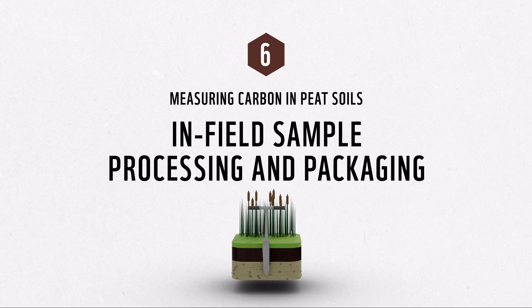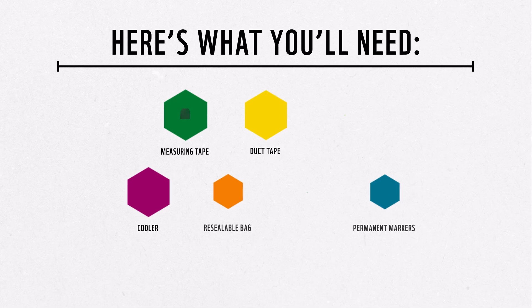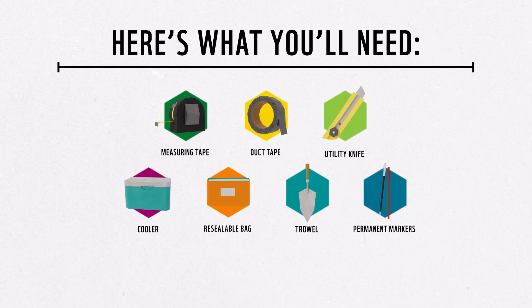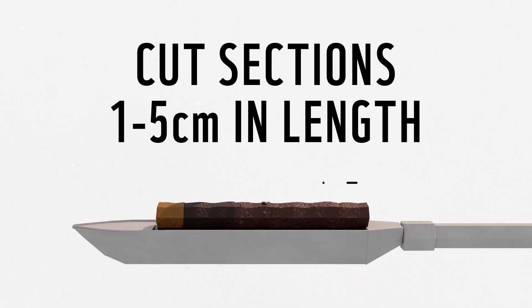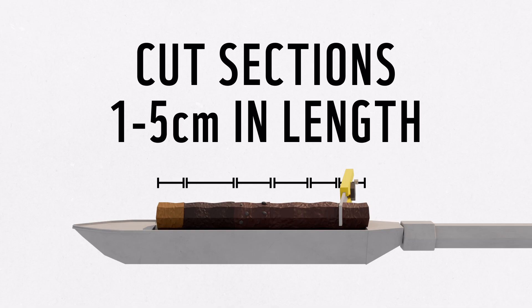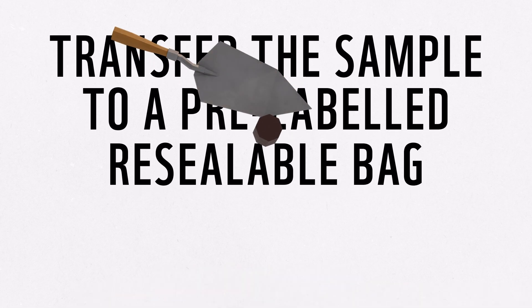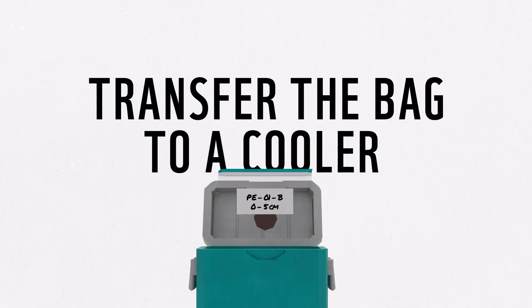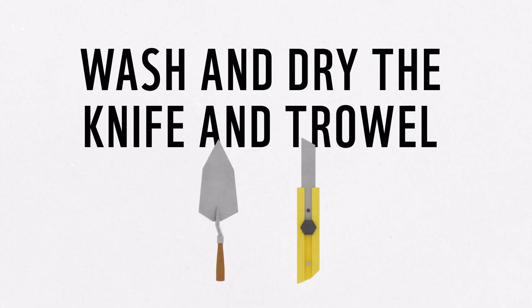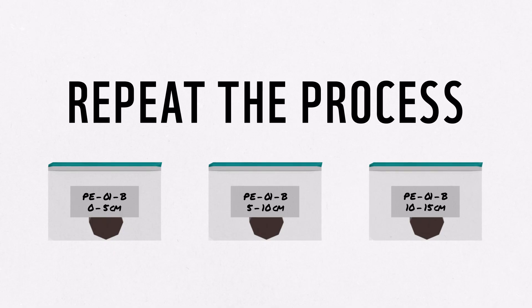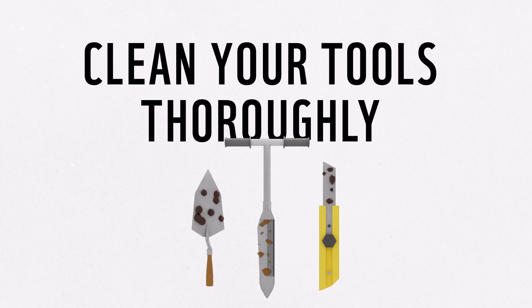Another option is to section the peat core in the field. To section the cores in the field, start at the top of the peat core and cut sections one to five centimeters in length, or wherever there is a noticeable change in soil type. With the knife remaining where it made the cut, use a trowel to transfer the sample to a pre-labeled resealable bag. Immediately transfer the resealable bag to a cooler. Wash and dry the knife and trowel. Repeat this process until the entire peat core is sectioned and packaged in the cooler. After everything has been packaged, clean the core and tools thoroughly.